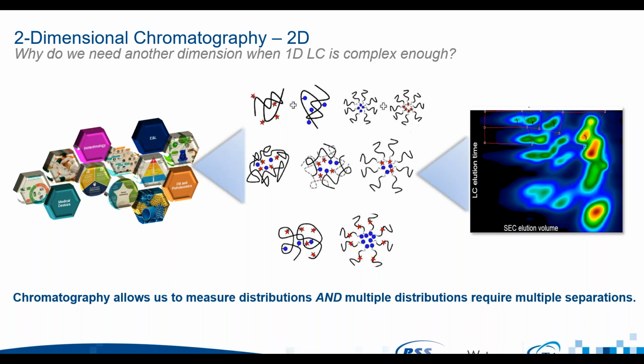So as R&D starts to explore more complex polymer architectures, things like block copolymers, grafted polymers, dendritic architectures, amphiphilic materials, I could go on and on and on, but the kind of structures that you're seeing in that cartoon in the center of the screen. And then we factor in blending these polymers or adding in associated additives in the case of many kind of master batch product formulations.